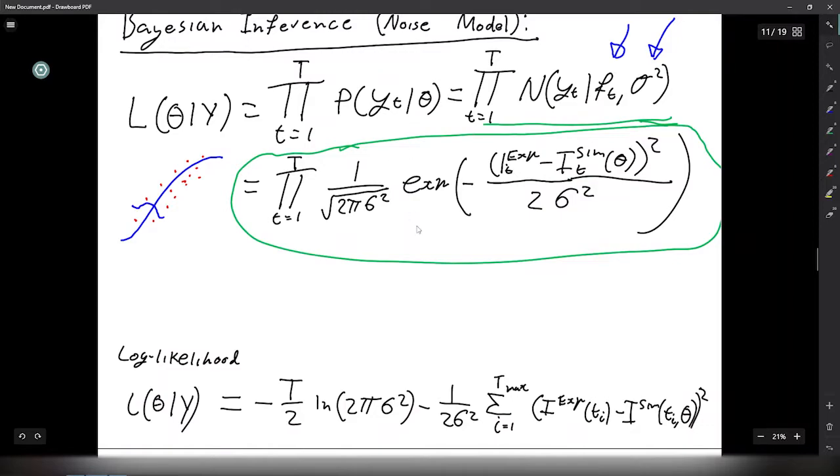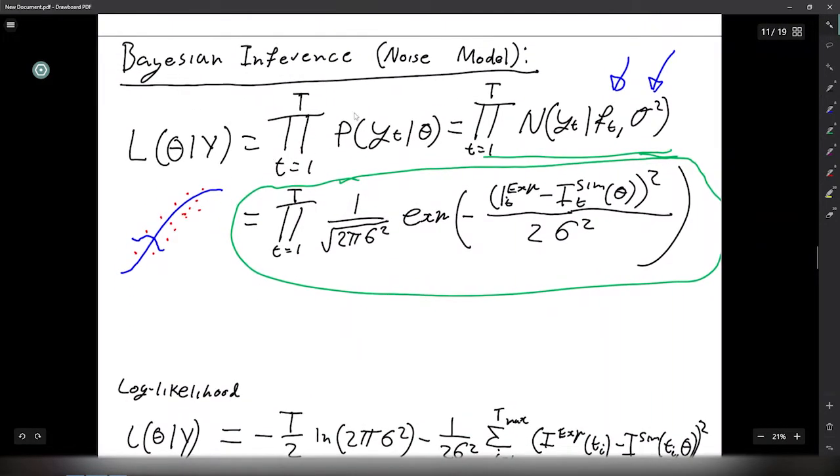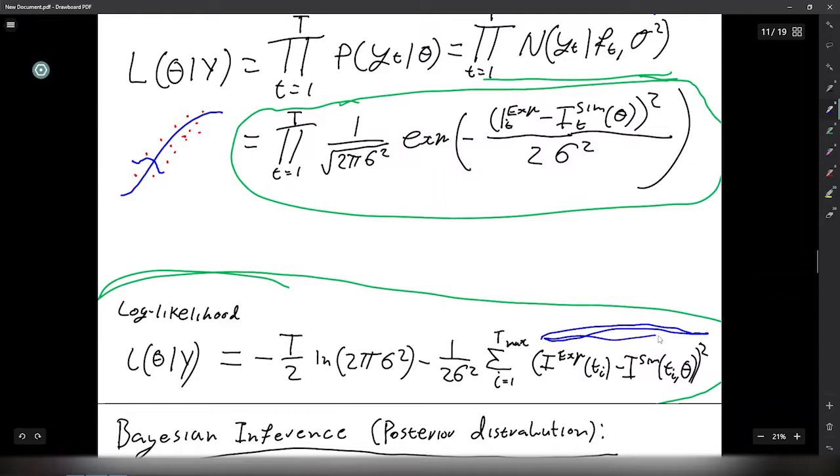When it comes to actually calculating the variation, we generally don't use the likelihood function itself because we're only concerned with ratios of them. We generally calculate the log likelihood, or the log likelihood here. So you'll see the log likelihood a lot more in literature, where you have your total current difference squared here, and then your sigmas here and here for each point in time again.